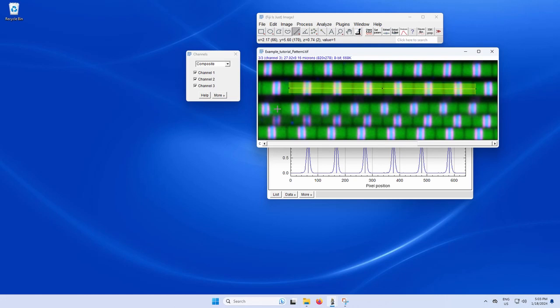Additionally, if the features of interest are dark, just like it would happen with electron microscopy images, you can invert the lookup table using the other optional button on the right of the PatternJ buttons. This function additionally corrects for background, which we found to be useful in many cases using electron microscopy images.